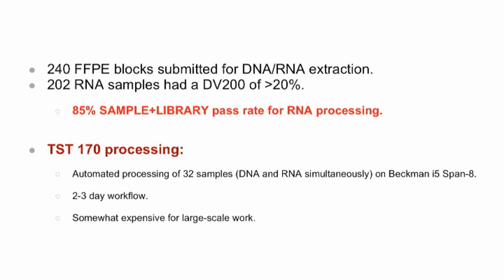To be fair, if you run it manually, or if you use a hybrid approach, some automation, some manual, with a really experienced technician, you will see slightly better libraries out of the manual protocol than out of the fully automated. But out of the automated protocol, you'll get exactly the same. We see our control samples have extraordinarily tight CVs from run to run to run. So it kind of depends on what your goal is: is it a highly reproducible process, or one where you're extracting every bit of quality out of it?